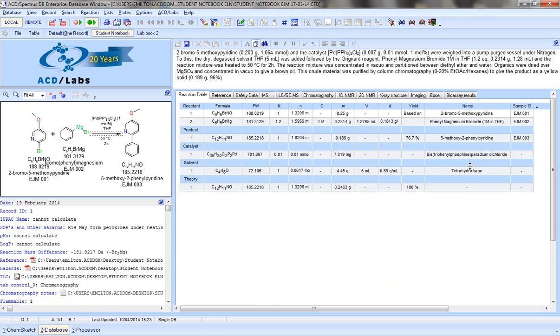And that concludes our quick overview of the Student Notebook, an application of Spectrus DB by ACD Labs.